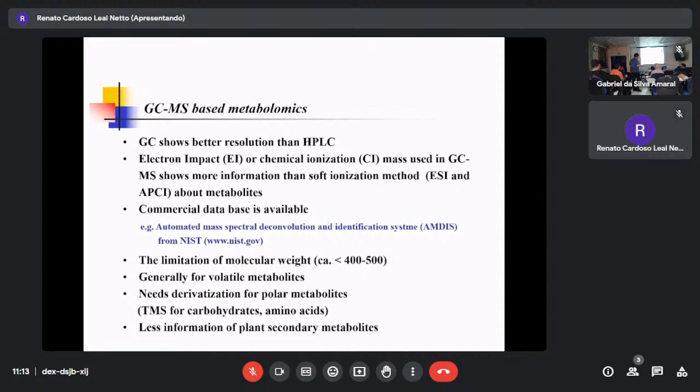But I have a question. Even sugar, organic acid, or steroids, sometimes if they are injected, you dissolve them in a solvent, some acetone, and inject it. The derivatized sugar boiling point is not less than 100 Celsius degree.